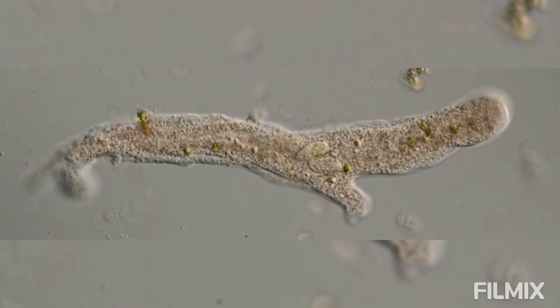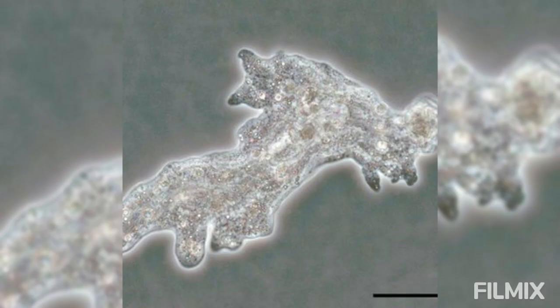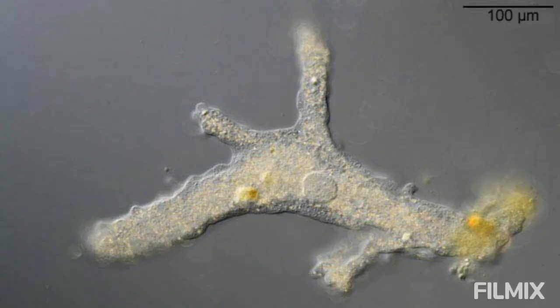A temporary culture of amoeba can be prepared in the laboratory by the hay infusion method. Decaying aquatic weeds or other organic substances such as hay, dry leaves, twigs, seeds etc. are taken and boiled with a sufficient amount of fresh water.